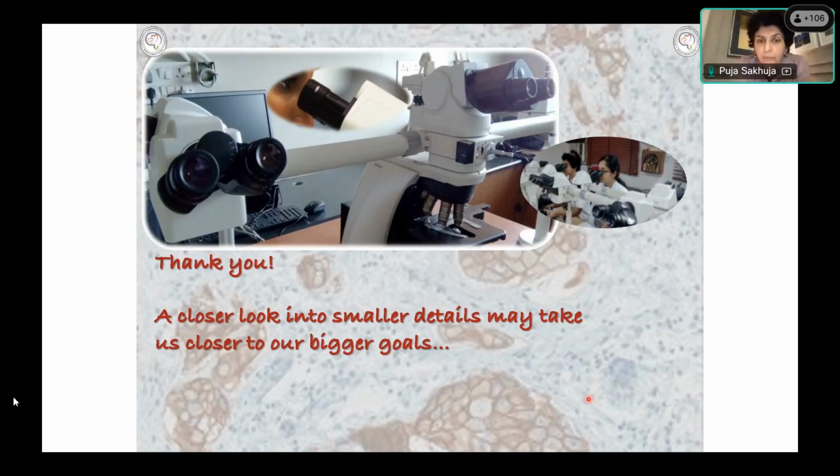And you must be very careful to see whether this granuloma is associated with a crypt which has a crypt abscess. Then take deeper sections, and see whether that crypt is rupturing and causing this granuloma. Then it could be a cryptolytic granuloma, which is seen in ulcerative colitis. But if that is not the case, and it is just an intercryptal microgranuloma, then it is likely to be Crohn's disease.